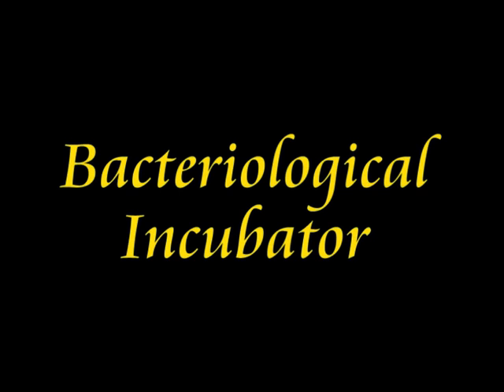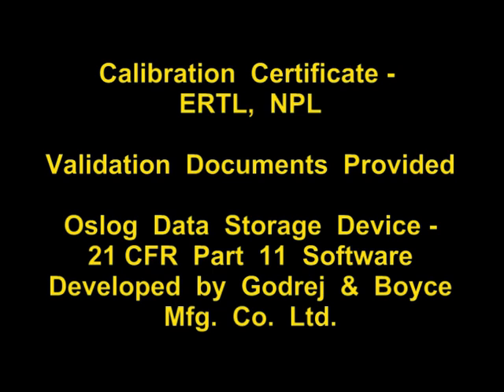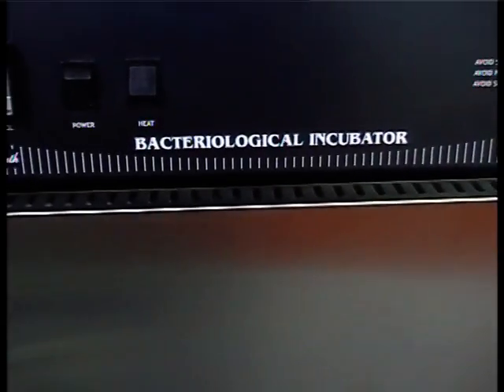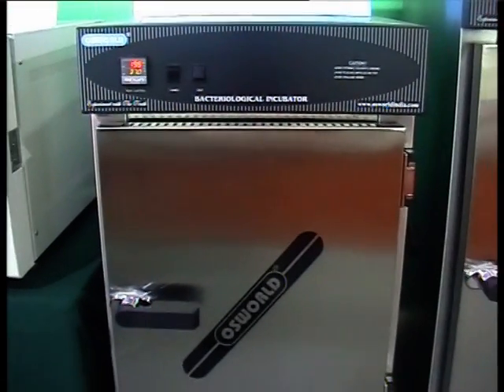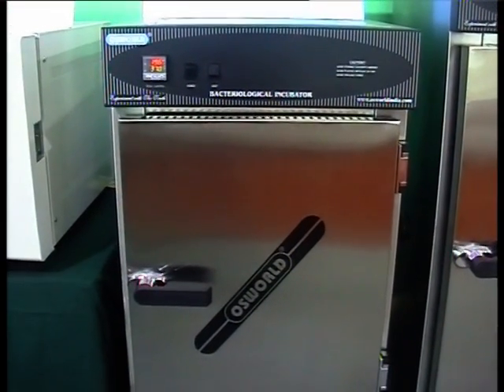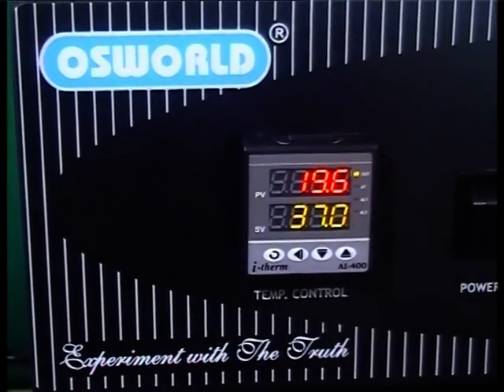The Oswald Bacteriological Incubator is double walled with an outer stainless steel metal door and an inner glass viewing door, which lets you view the sample with minimal heat loss. Oswald Bacteriological Incubators are designed to serve a wide span of requirements, more specifically to maintain optimal temperature conditions for growth of microbiological cultures in a controlled environment. This incubator is just one among our customer acclaimed products.